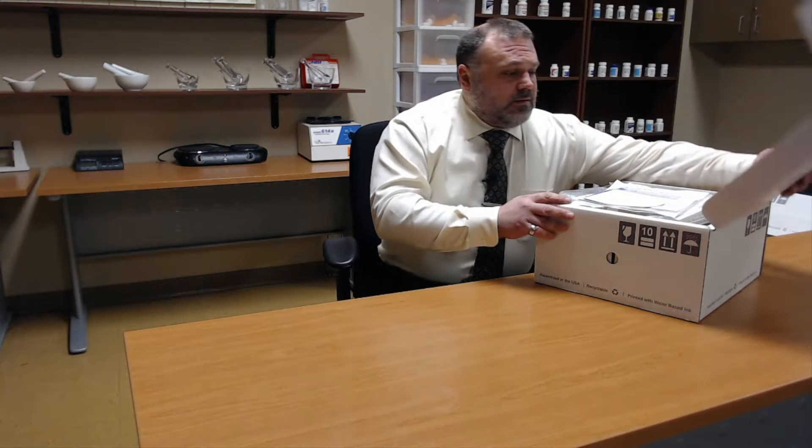You should receive this in the mail, shipped to your house. Usually you will receive it the first or second week of the term in which you are entering that lab course.